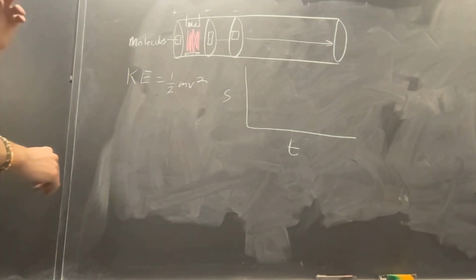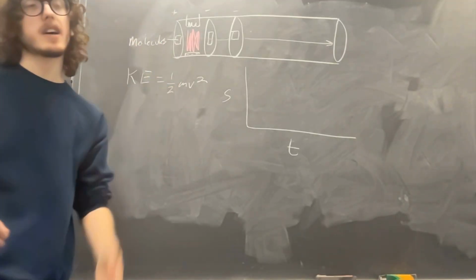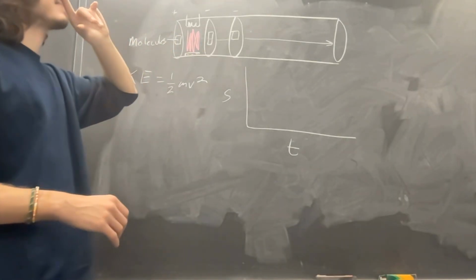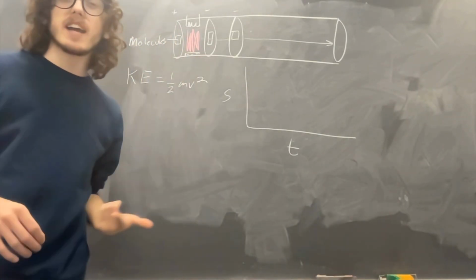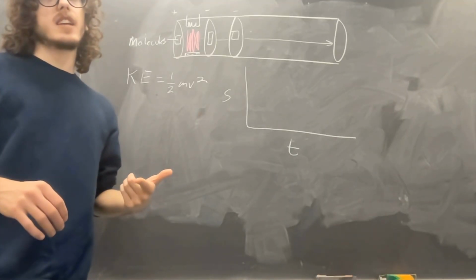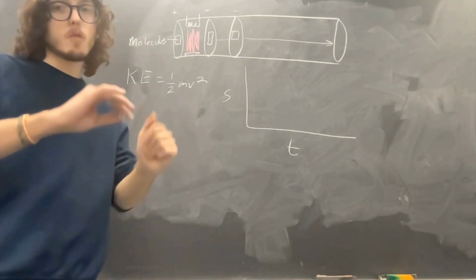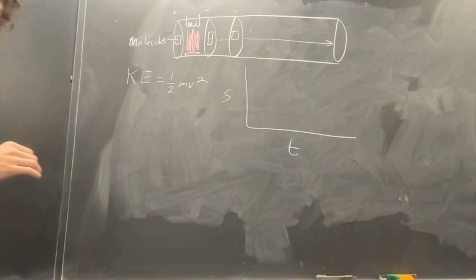Now, we're going to go through this, and hopefully you've watched my other videos. If you haven't, this is called an electron impact ionizer. If you at least know what this is, it will be really easy to understand. If not, go back, but I will give a short introduction and review.